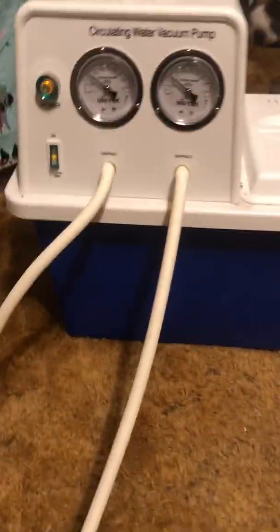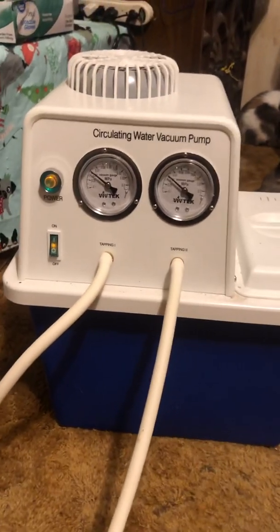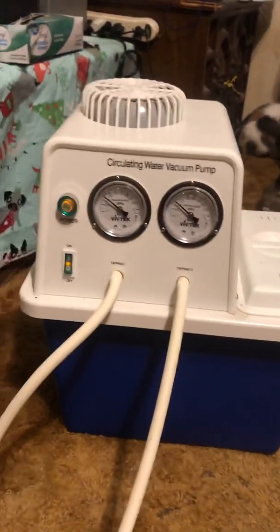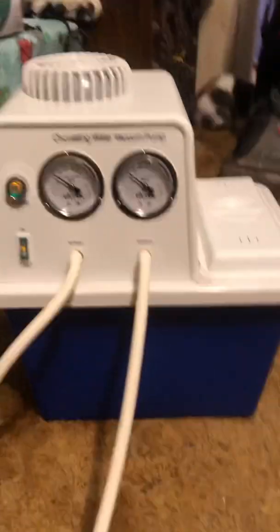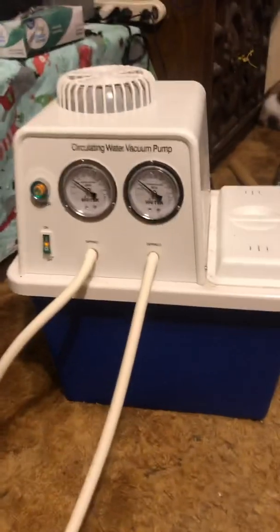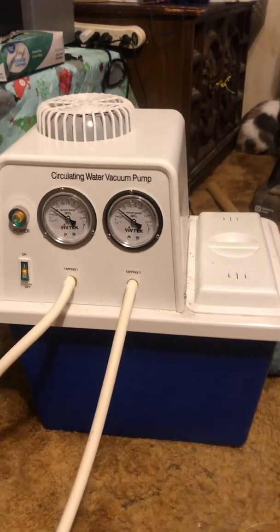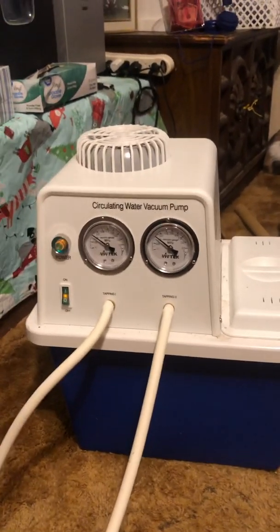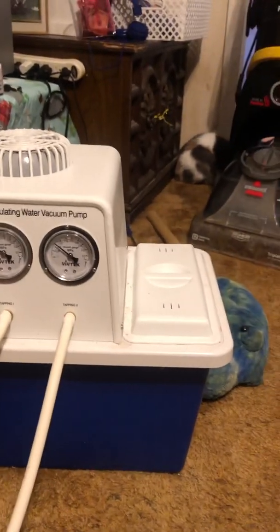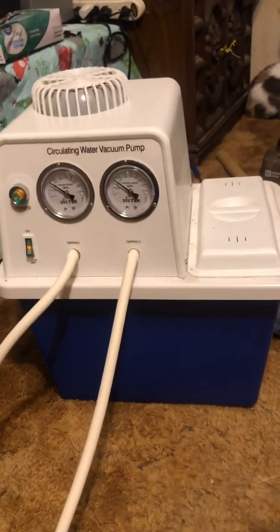This is just a circulating water vacuum pump. It's not a really high-powered one, but it does the job efficiently. It could also work with a water pump if I had the tubes — you can actually run the condenser off of this as well, but I choose not to; it's just easier for me to do it this way.